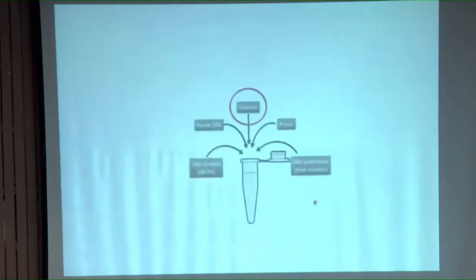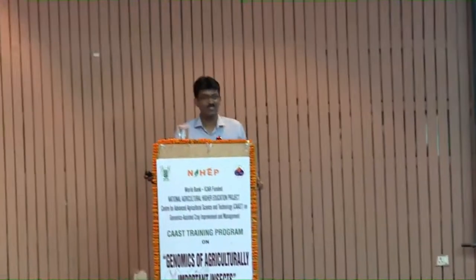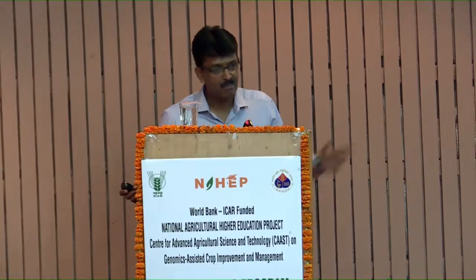Good. So now, what is this dye? That is another question. Everything you know now, you have a buffer, magnesium, dNTP, primers, enzyme, your template DNA, plus one extra chemical. And there is a name for that. The name is detector. Why is it a detector? That is going to report to you whether the amplification is happening or not. So this is called the detector. In other terms, the detector is nothing but the dyes, correct?